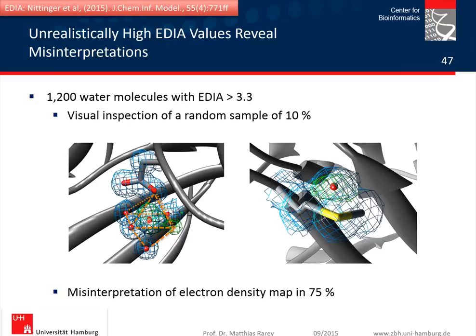So here you basically see a water molecule, and we have superimposed an octahedron just to show you that most likely this is a metal ion here from the interactions this is able to form. Or situations like this where you have a water molecule, and this is very likely an alternate location for the sidechain over here. Okay, more on waters you can find in this publication here. As always, time is much too short to say all the details of such a study. And this closes the 4th part of my presentation.